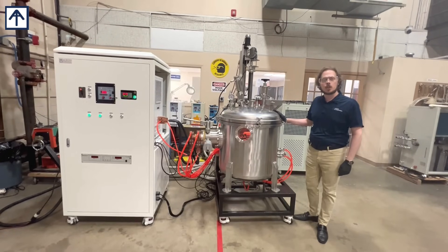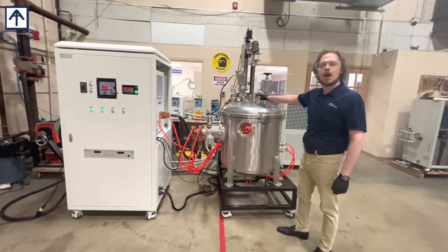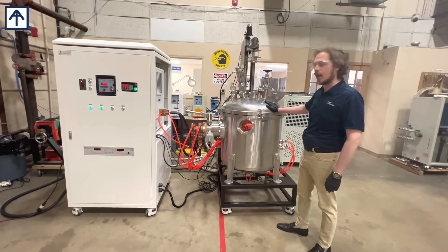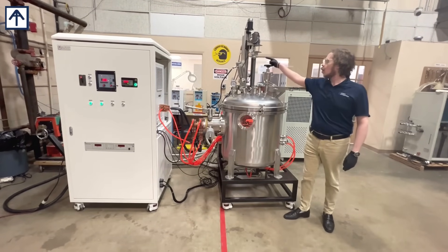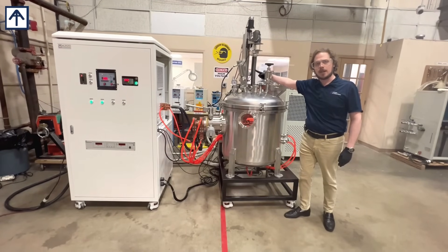This 45 kilowatt induction melting system comes complete with sight glasses so you may monitor your melt, has a water-cooled chamber that is cool to the touch, and can be configured with your option of either a contactless pyrometer for detecting temperature, or a submersible thermocouple that can be raised and lowered into your melting cup.